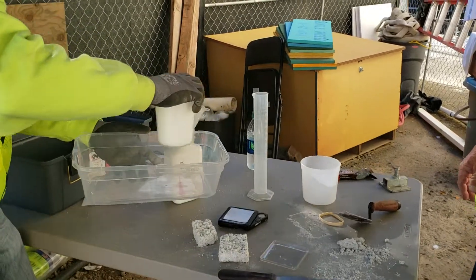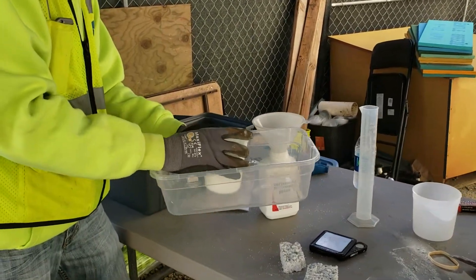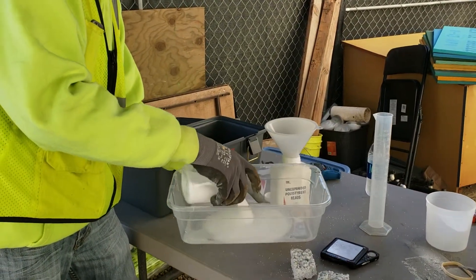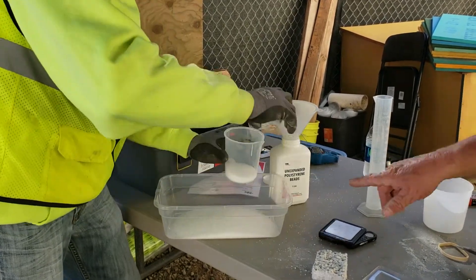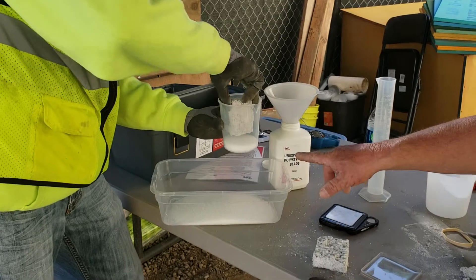Now we don't want to lose any of these beads, so we dump them out to make room for our sample. We leave a little bit in the bottom — yes, we want to leave some in the bottom.